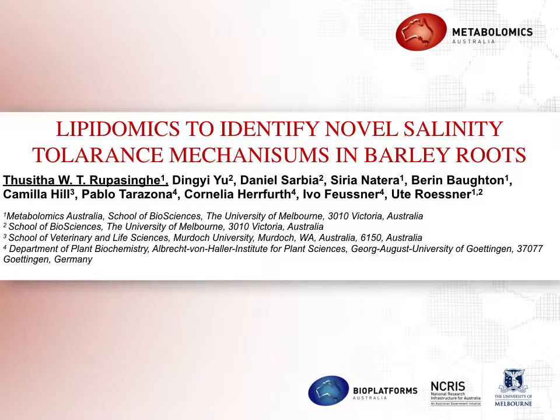I am Thusitha Rupasinghe from Metabolomics Australia, the University of Melbourne. My presentation is mainly focused on investigation of the salinity tolerance mechanism in barley roots using lipidomics platform.